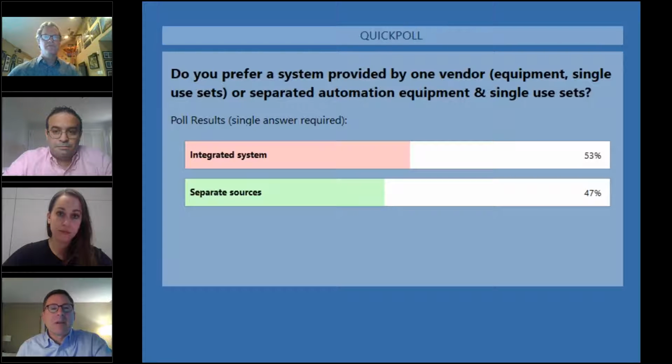Okay. And Amy, final thoughts on this question? Yeah, of course, I agree again. I think the biggest issues are with some of those unique components. There is a lot of interest in cell therapies, and vendors are definitely getting on board. But depending on the process you're working on, there's a lot of different needs. With traditional T-cell therapies, things like activation reagents can be difficult.